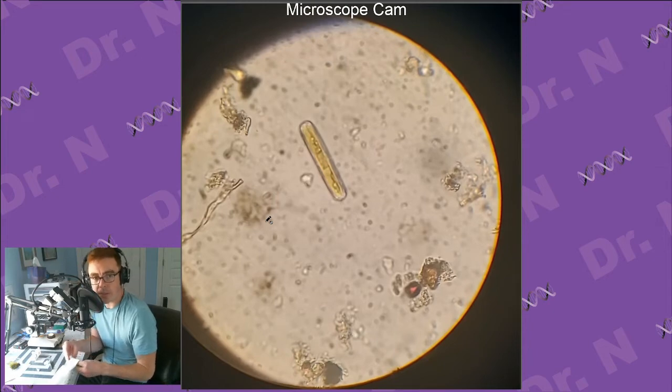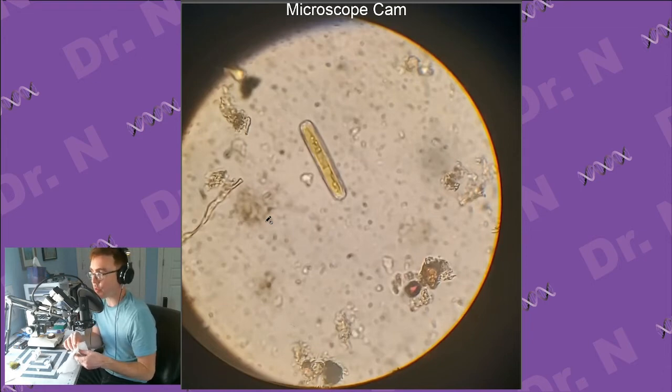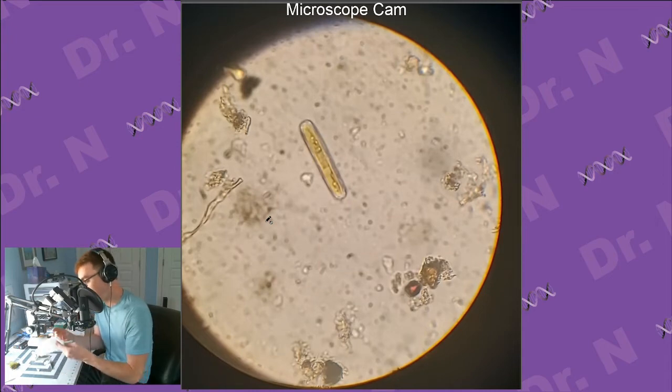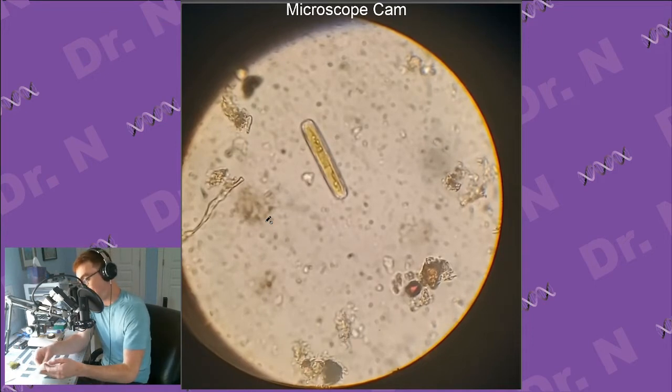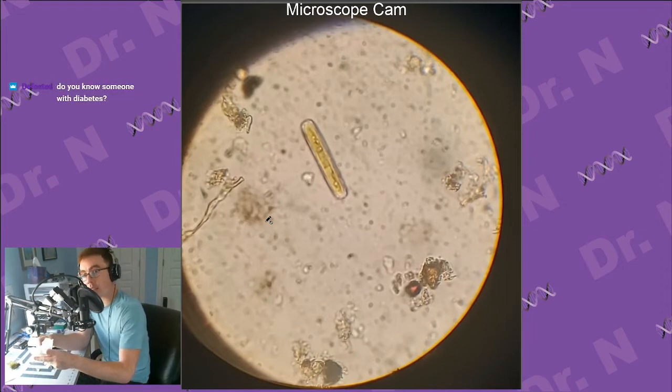So, human skin cells on the inside of your cheek are just really nice. They are generally pretty flat. They're pretty big, and it doesn't hurt to obtain them. It'd be kind of cool to get a blood sample at some point, but I don't really want to take blood from myself. I need to find a way to just more or less safely give myself a pinprick to look at that. And blood's nice because you don't need a stain to see the red blood cells. They are pretty obvious. White blood cells you can sort of use a stain to look at.